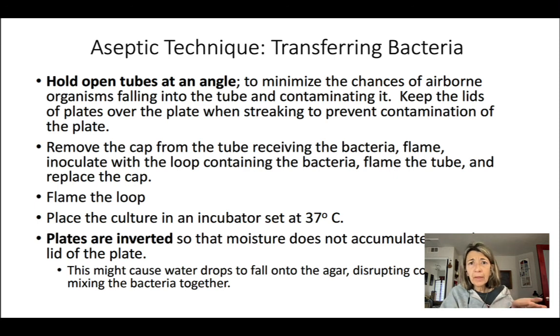So again, why do you have it upside down? Because otherwise the moisture remains, so you're going to get drops of liquid inside the lid, and then they can drop on the culture, contaminating it. So that's why we always have the plate upside down.